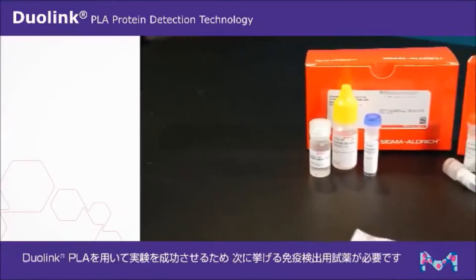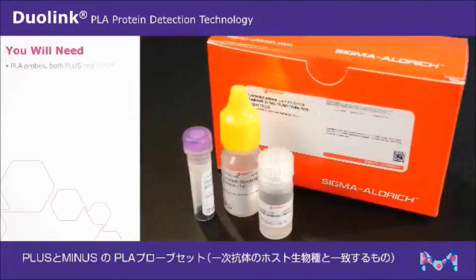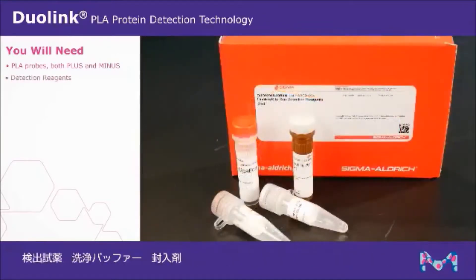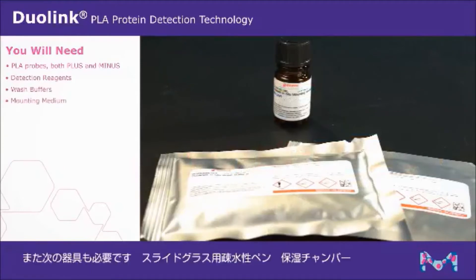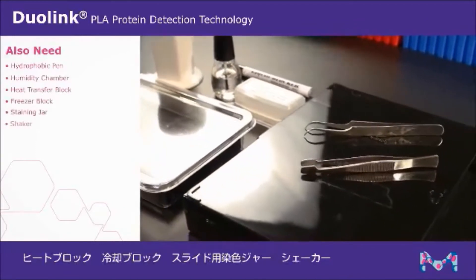To successfully run a Duolink proximity ligation assay, you will need the following products: a pair of PLA probes, both plus and minus, that match the host of your primary antibodies, detection reagents, wash buffers, and mounting medium. You will also need a hydrophobic pen, humidity chamber, heat transfer block, freezer block, staining jar, and a shaker.